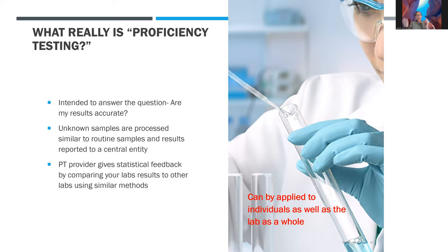And proficiency testing, quality control, how are those different and so forth? Well, proficiency testing is intended to answer the question, are my results accurate as I've reported? And proficiency testing is not just a test of the instrument. It's a test of your entire testing and reporting process. And that's a very important distinction, because we need to know where those pre-analytic and post-analytic problems are just as much as we need to know where the analytic issues are, so that we can provide this kind of result and assurance to our patients and clients that, hey, when we say this is what it is, that's what it is. And that stacks up well compared to any other laboratory you may want to send it to.